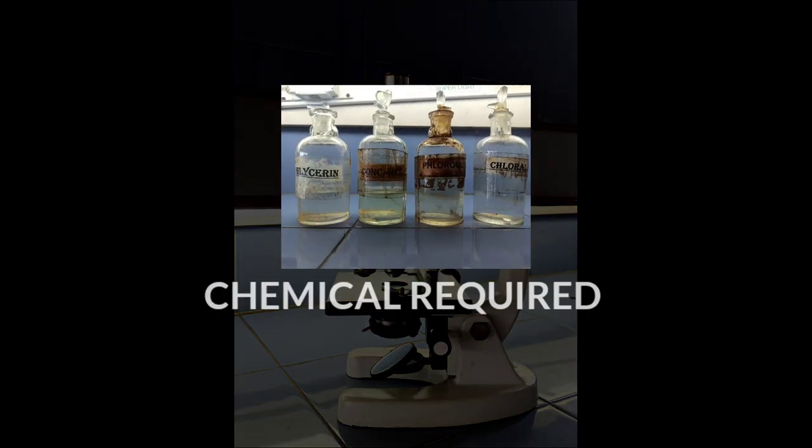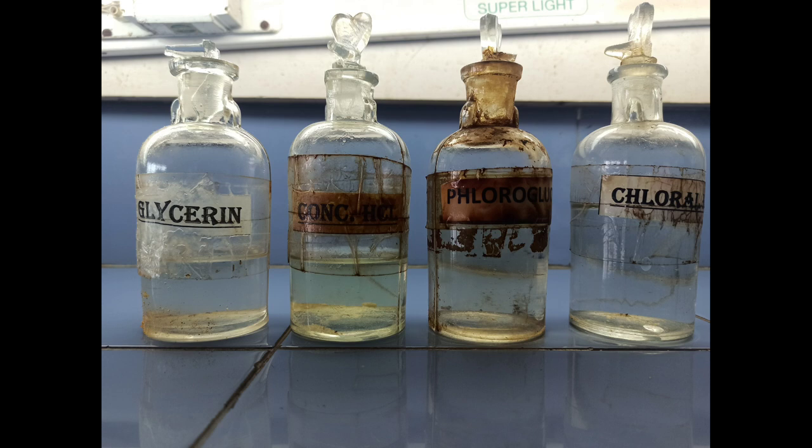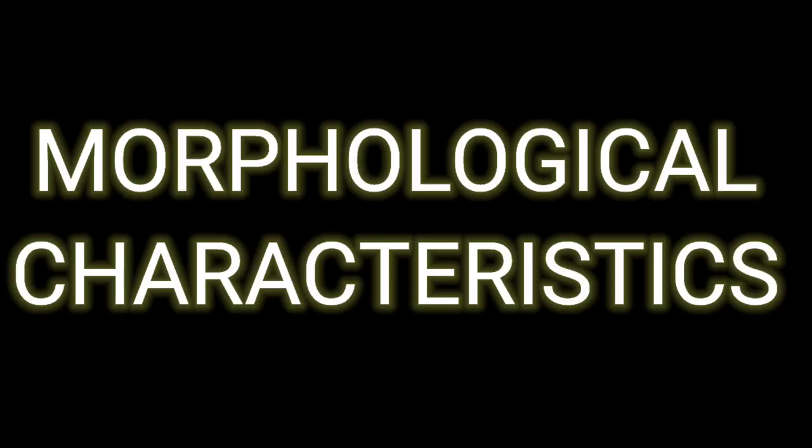Chemicals required are glycerin, concentrated HCl, phloroglucinol, and chloral hydrate. Now let's study the morphological characteristics of ephedra stem.